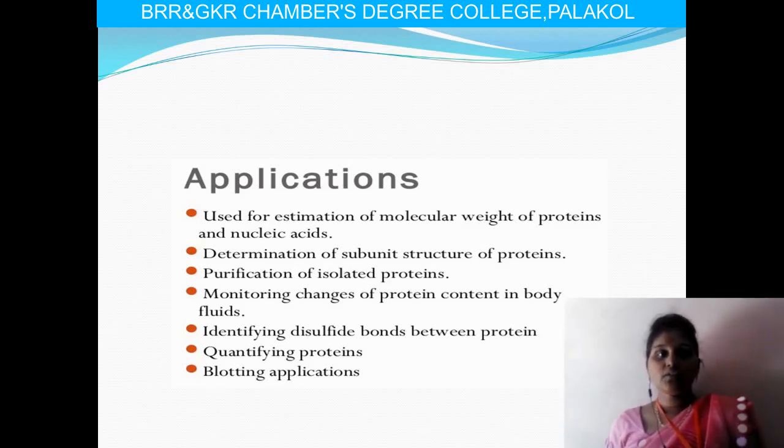And it is also used for quantifying. The number of proteins can be observed, and blotting applications also. Blotting means the preservation of some of the proteins and nucleic acids like RNA and DNA. So for these purposes also we can use this electrophoresis.